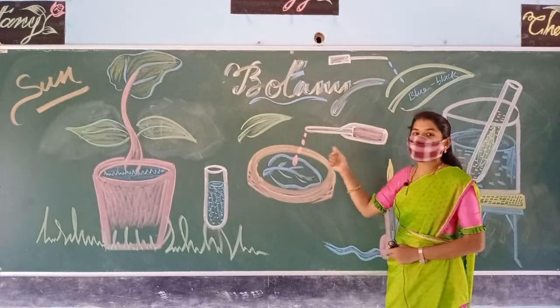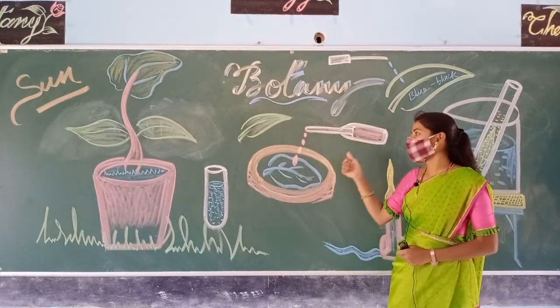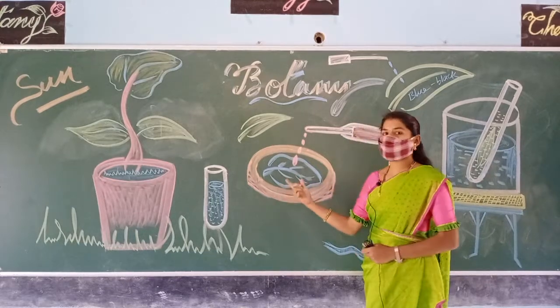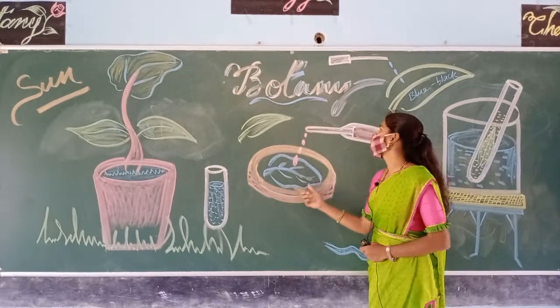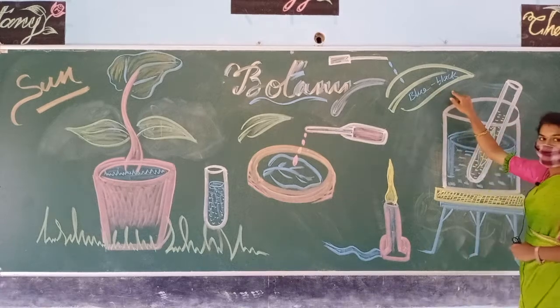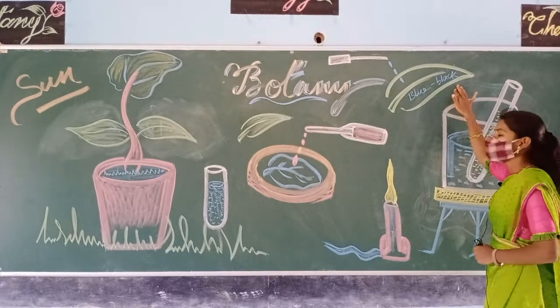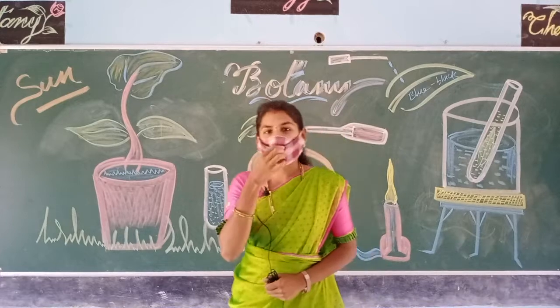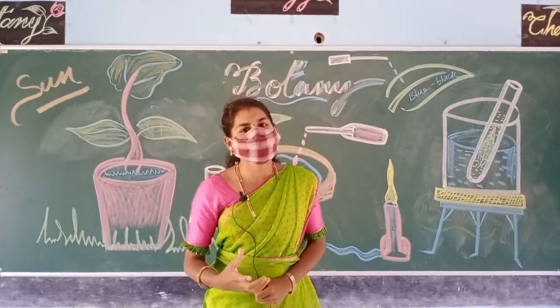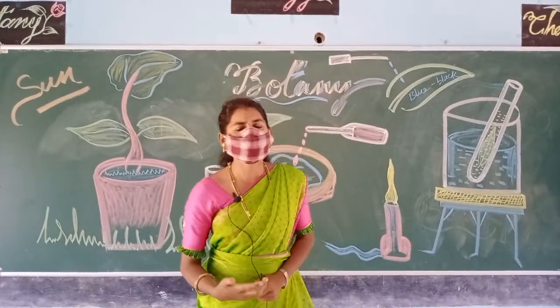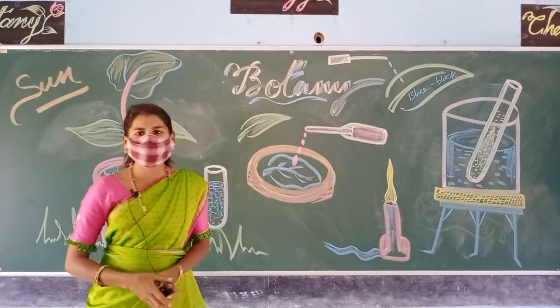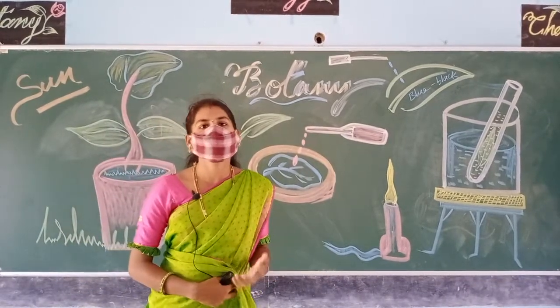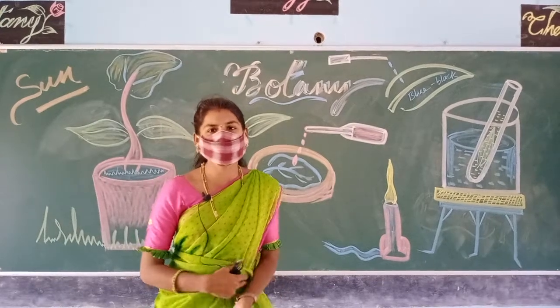Now add iodine solution to the leaf in the petri dish. The leaf, which was pale white, slowly turns blue-black in color. This shows the presence of starch in the leaf and also tells us that starch is a carbohydrate. In this way we can prove that plants prepare food in the form of starch, which is an example of a carbohydrate.